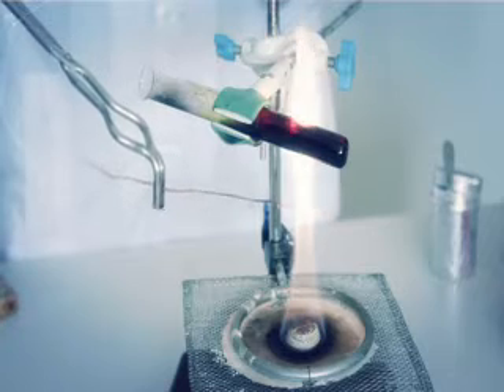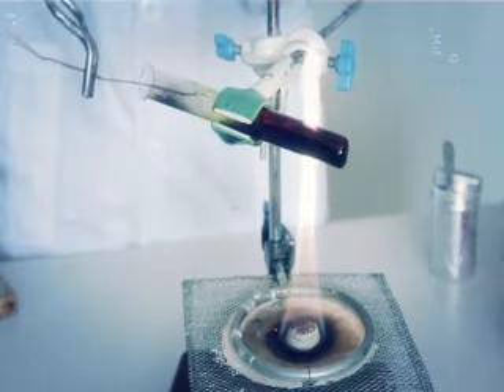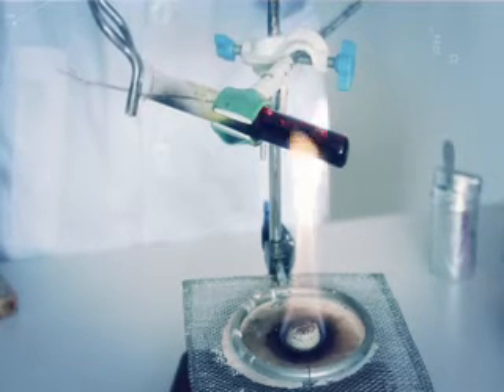Одновременно наколи небольшой пучок медных проволочек, держа их пинцетом в пламени горелки. Когда проволочки раскалятся до вишневого цвета, осторожно внеси их в пробирку. При этом нужно перенести нагрев на нижнюю часть пробирки. Поместив пучок в пробирку, постарайся, чтобы он оставался в верхней или средней части пробирки. Если медь упадет на дно, горение будет плохо видно, а пробирка может треснуть.